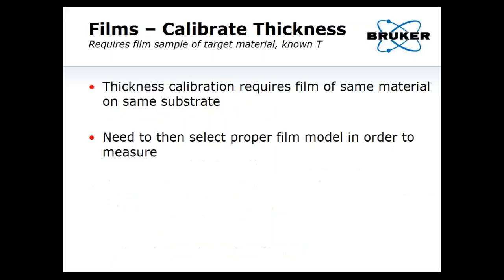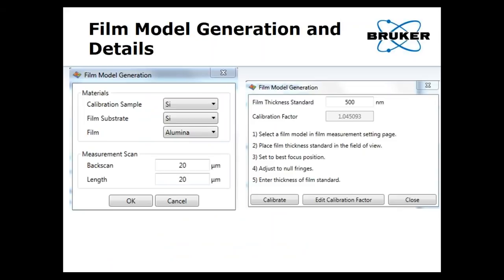Once the model is built, you can calibrate thickness. It requires a sample of the same material on the same substrate. You pick the same model you just generated, then calibrate. The software will do the measurement, provide a result, and then you enter a nominal value to get a calibration factor. Here you can see it's only about 4% off the nominal. This definitely maximizes accuracy, but you can get away with a calibration value of unity and still get pretty accurate results natively.